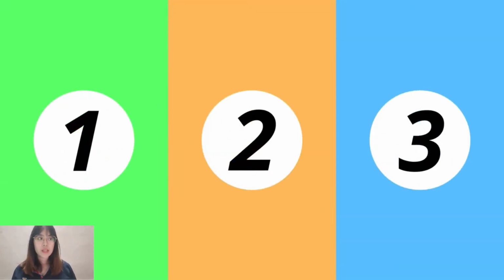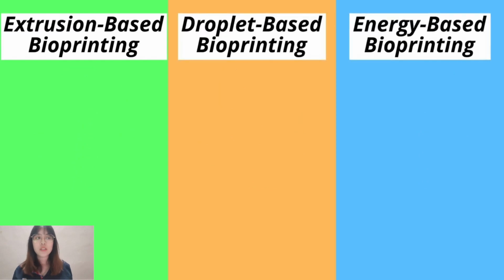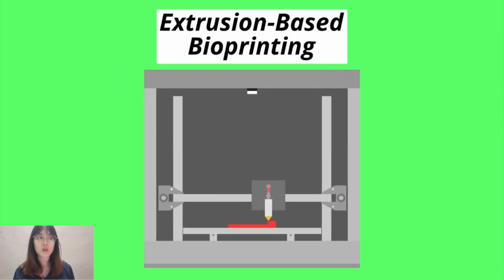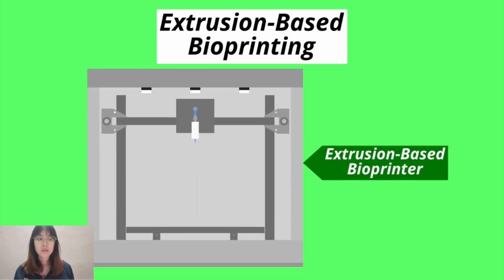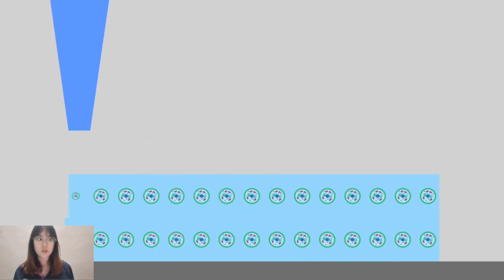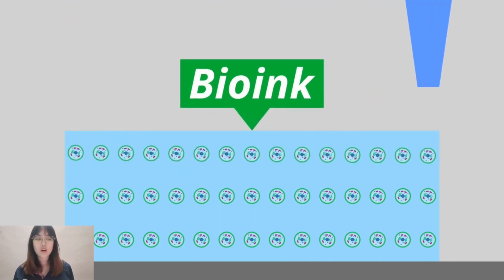Bioprinting usually exists in three types, which I will introduce to you. Firstly, extrusion-based bioprinting is similar to what most people think of when they think of a conventional 3D printer. It involves forcing continuous filaments of a material through a nozzle in a controlled manner to create a 3D structure. The material is bioink, which usually consists of cells and a hydrogel.